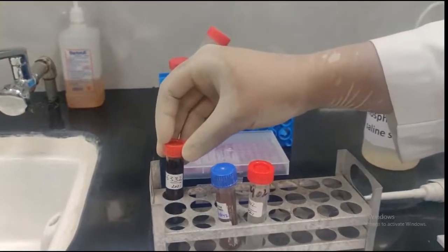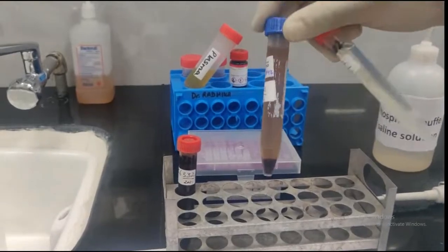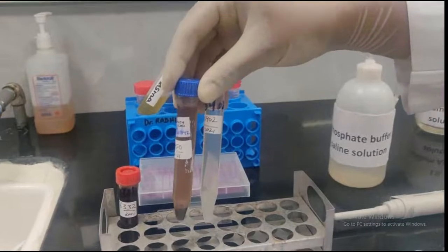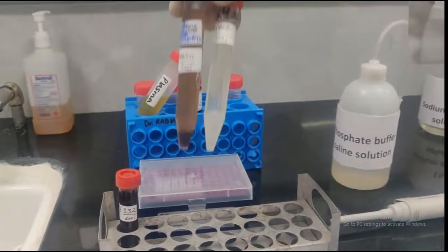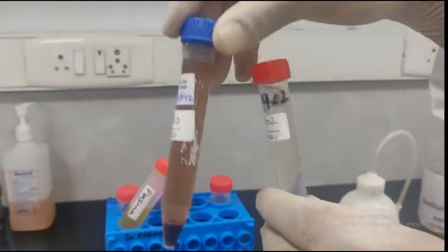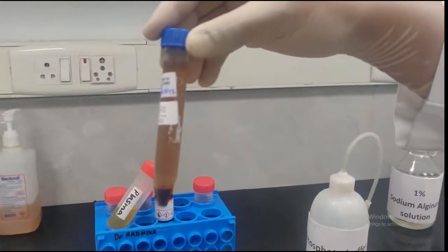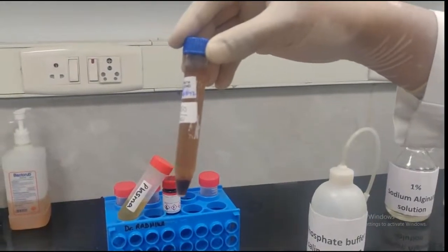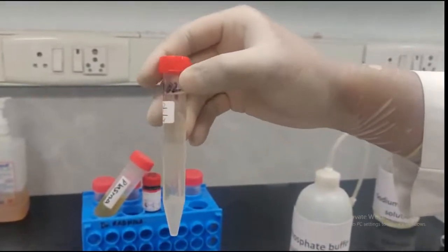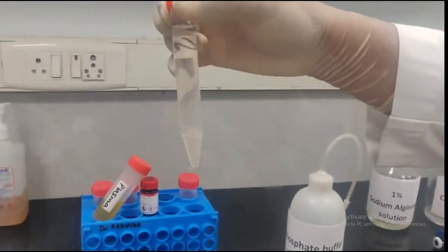Subsequently, the tube is kept overnight, and the sample is allowed to fix in neutral buffered formalin. And in the next tubes, you can see a pellet has settled down at the bottom. So in the first tube, the blue cap, we can see the final aspirate pellet that has formed after overnight fixation in 10% neutral buffered formalin. And the tube with the red cap is an effusion fluid specimen wherein the pellet has formed at the bottom after overnight fixation.